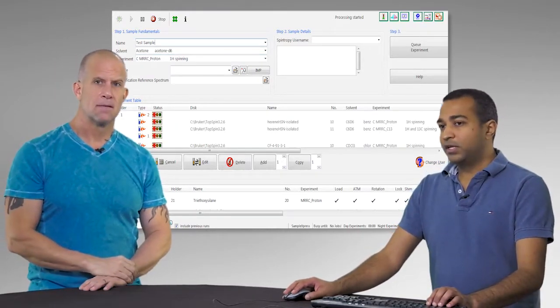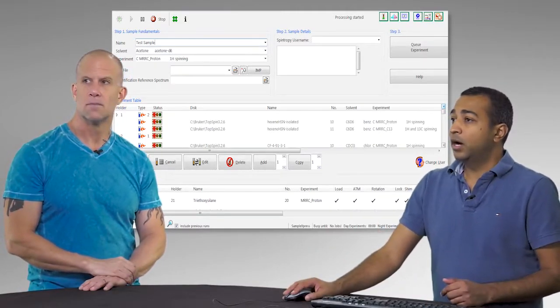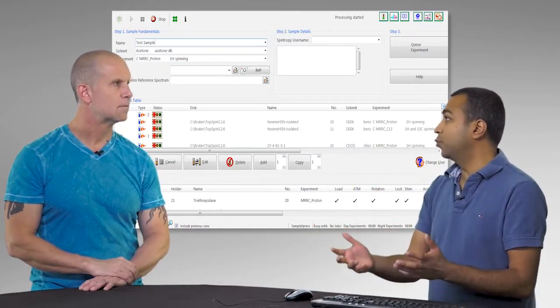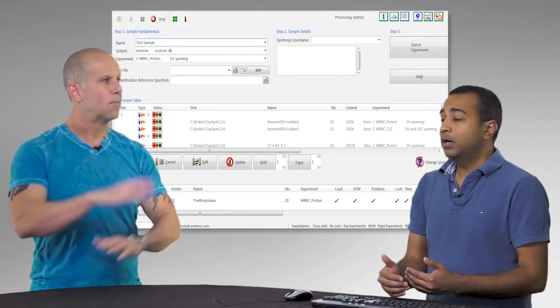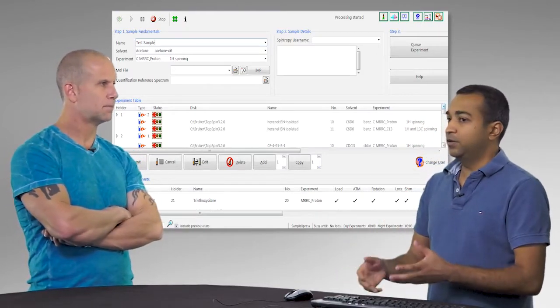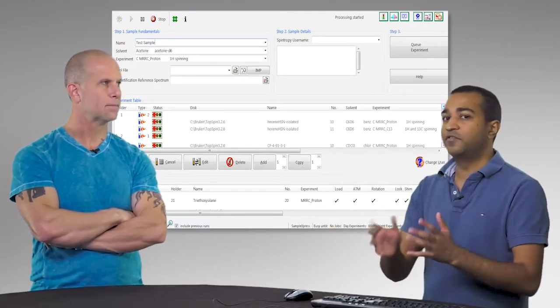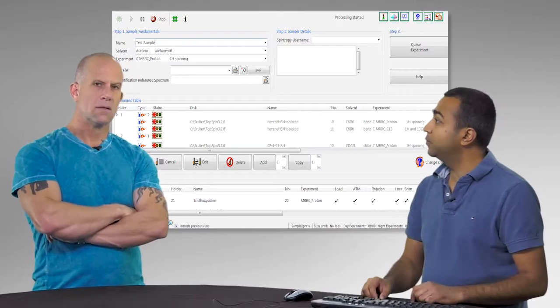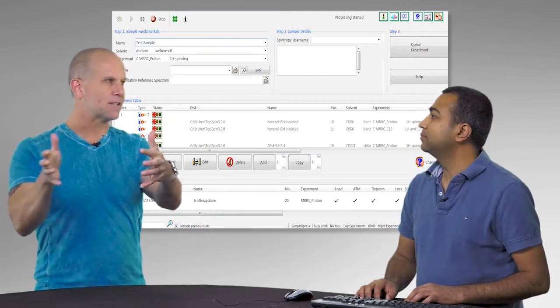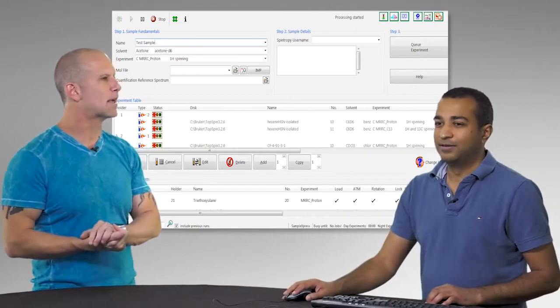The important thing to keep in mind here is that you can actually run more than one experiment, and the same name that you enter here will be given to all of those experiments that you run on that one sample. So it puts subfolders in. When you go to the data handling site, which I'll show you later, they'll actually all be divided out, but they'll have the same name. And there's some information that's displayed there that lets you differentiate them. I always have a rule of thumb, because when I think of a name being associated with a file, I always tend to not want to use spaces and use underscores and stuff because of Linux.